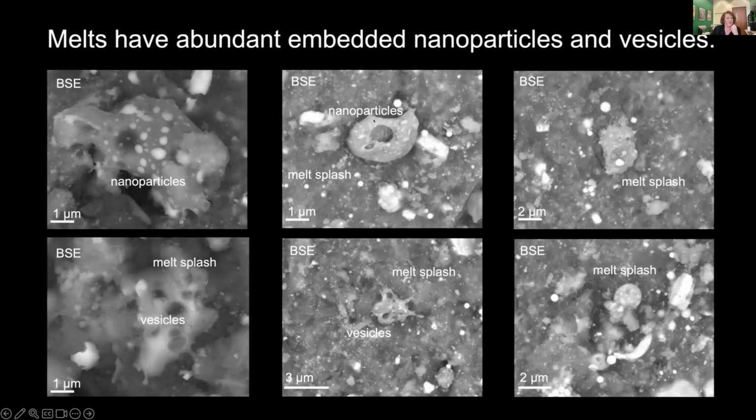Some of them have this almost droplet-like shape. Some of them are really almost like amoeboid shaped, but all of them have vesicles or bubbles that are distributed throughout the melt deposits, as well as these higher Z-phase nanoparticles, that include the iron nanoparticles like we've seen in samples returned from other planetary bodies. The size of these nanoparticles varies. Some of them are a few nanometers in diameter, moving all the way out to approaching a micron.